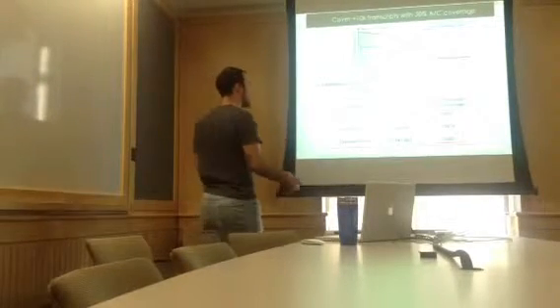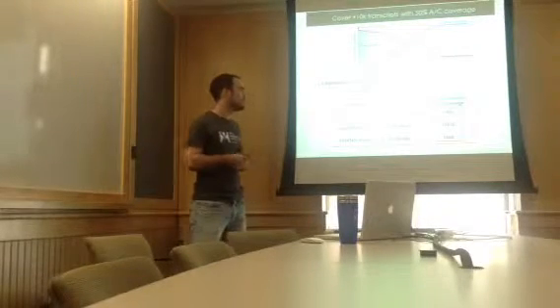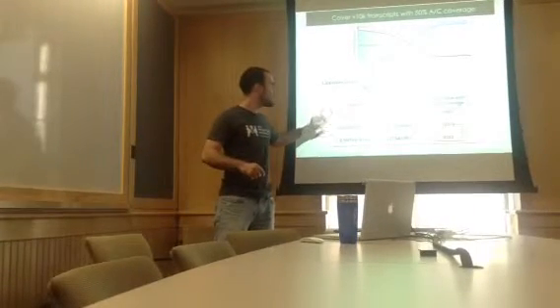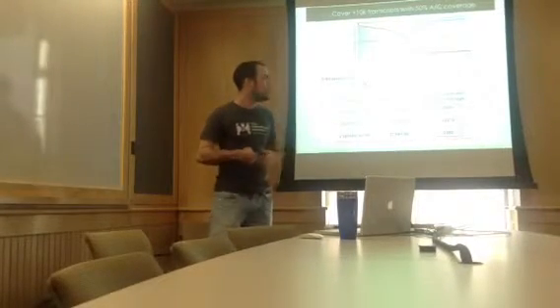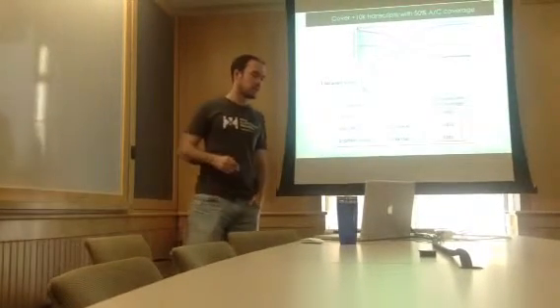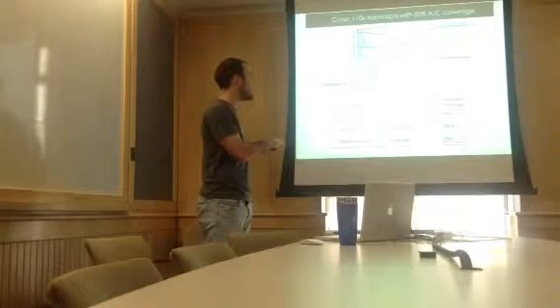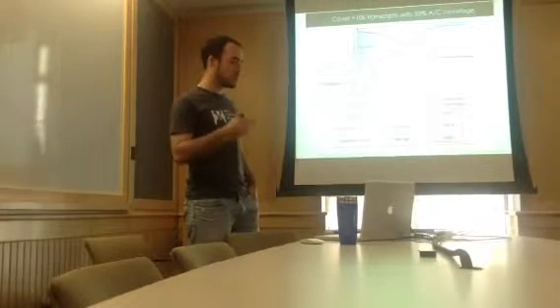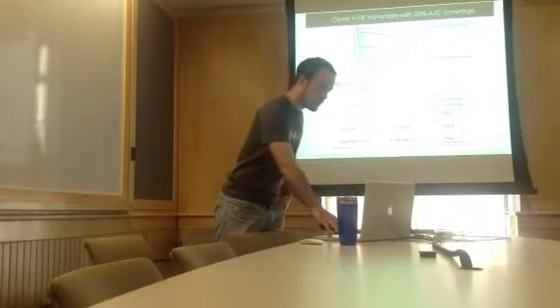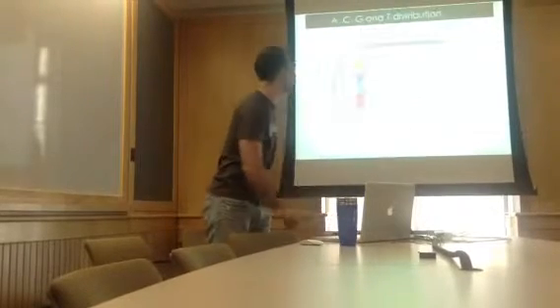And I built a library for DMS in vitro and DMS in vivo, and also SHAPE in vitro, and we have more depth of sequencing for the DMS libraries. With the depth of sequencing that we have, we have over 10,000 transcripts for which we have more than 50% coverage on A and C for DMS, and for all the nucleotides, more than 2,000 for SHAPE. So we have a fairly good number of transcripts in which we have enough information to study them further.